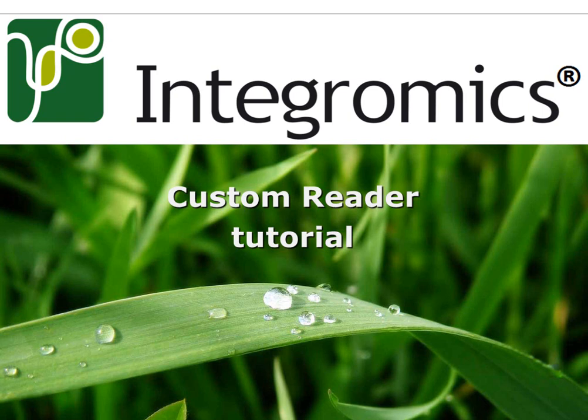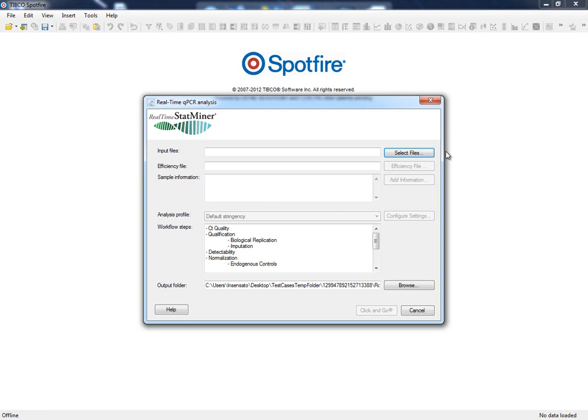In the previous custom reader video in this series of tutorials, we had an overview of how the analysis is configured, how to load data files, define our experimental design, and finally choose the configuration settings.